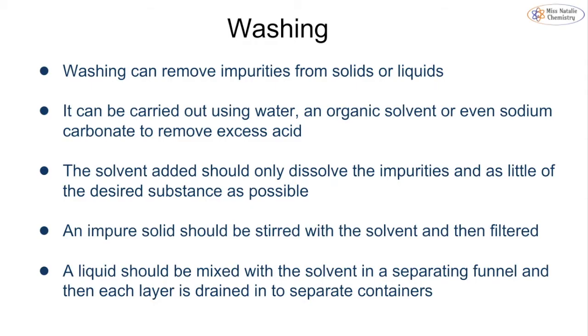The solvent that we add, whether it's water or an organic solvent, should dissolve only the impurities that are in our substance. We want to keep as much of our desired substance as possible. Any impure solid is going to be stirred with the solvent, and then we filter it. So the impurities are going to then dissolve into the solvent. And then when we filter it, we are left with our desired product.